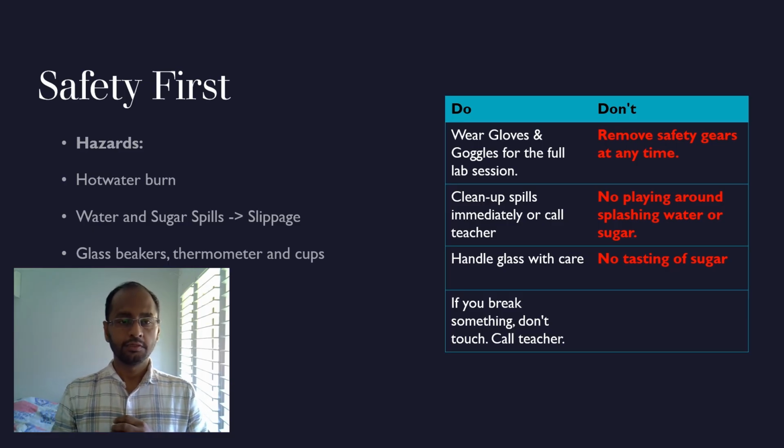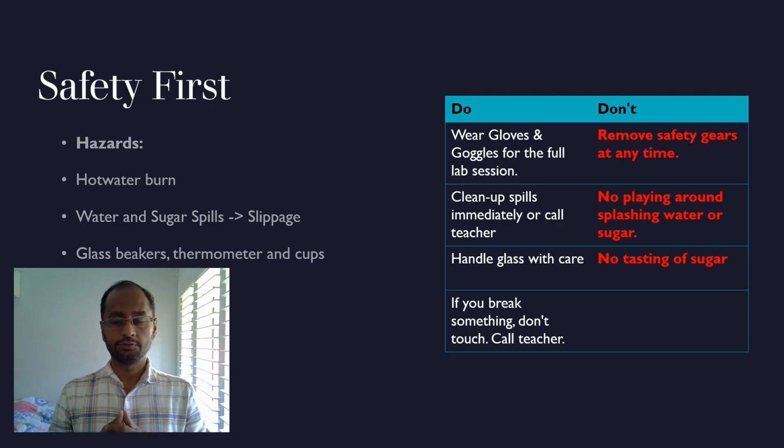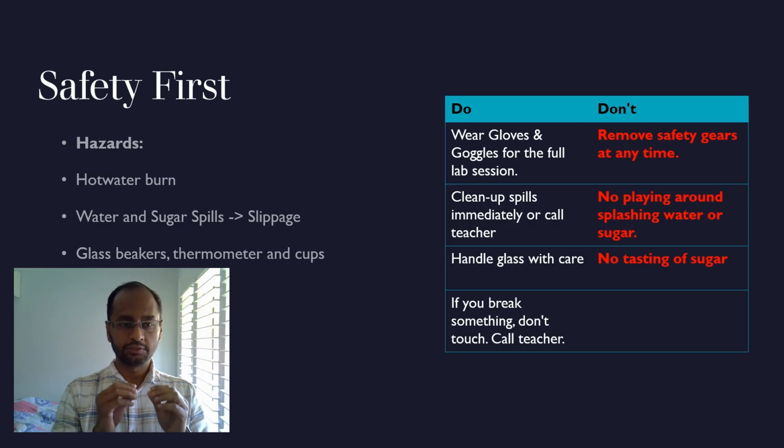That's simple. If you spot any dangers, spills or breaks, stay calm. Don't be a hero in trying to fix things. Call for help. You have me and you have the lab attendants in the lab, so call for one of them. The step by step instructions of what we just spoke is on your table. Take a couple of minutes to read them before you start the experiment.